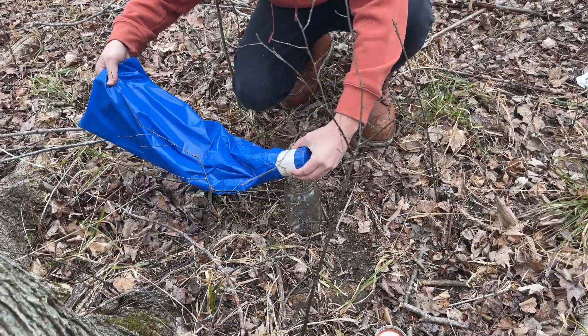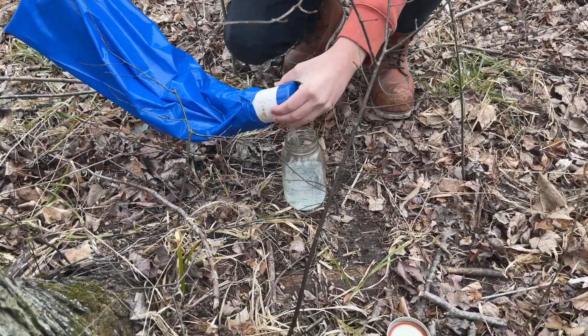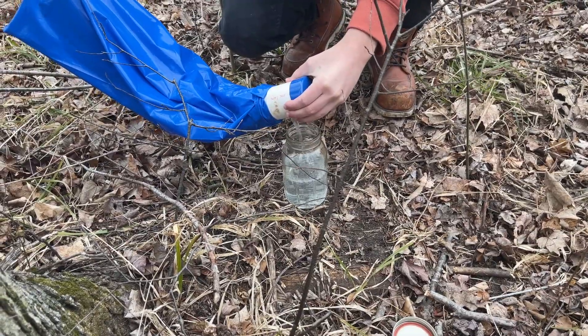Maple tree sap contains 1-2% sugar content which is kind of low but it works fine for propagating mushroom mycelium.